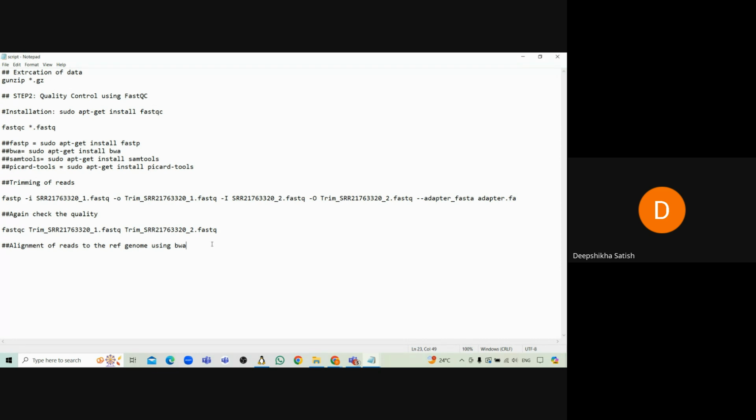This data which we have decided for the analysis is for checking the variation in BRCA1. Yeah, in the first session I showed the SRA page. This BRCA1 gene is located on the 17th chromosome of human. So we are downloading the 17th chromosome of human instead of the whole genome and considering this as a reference for now.